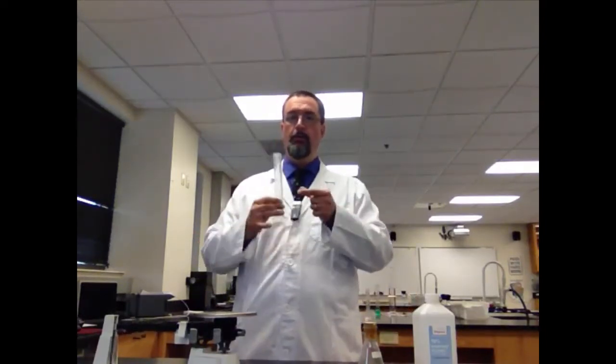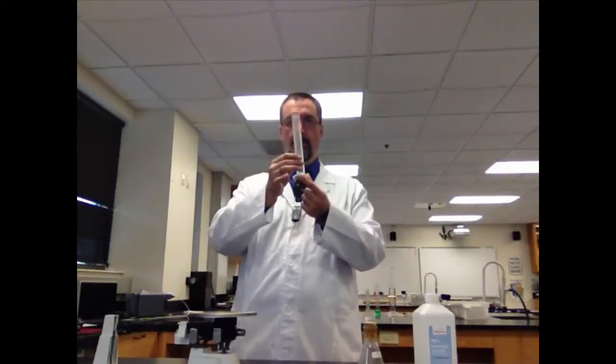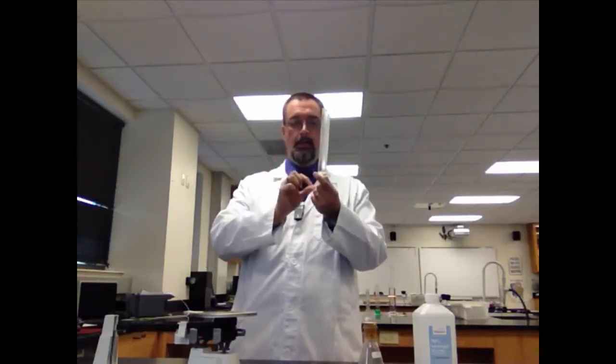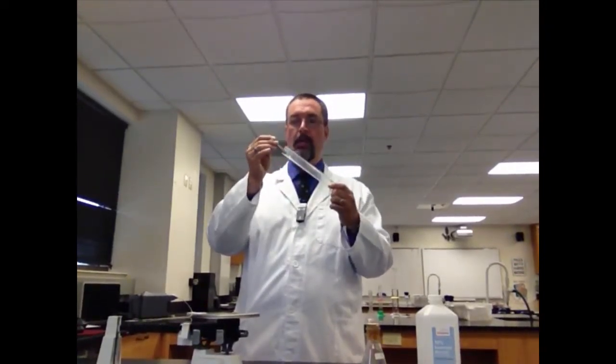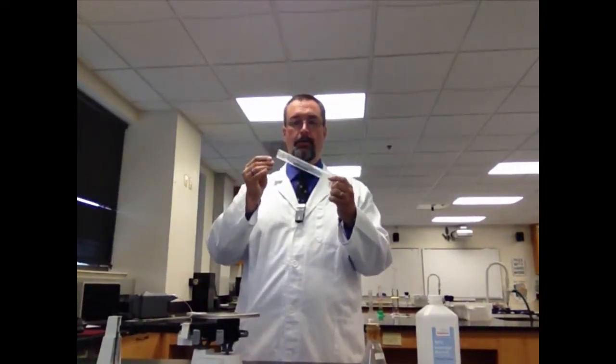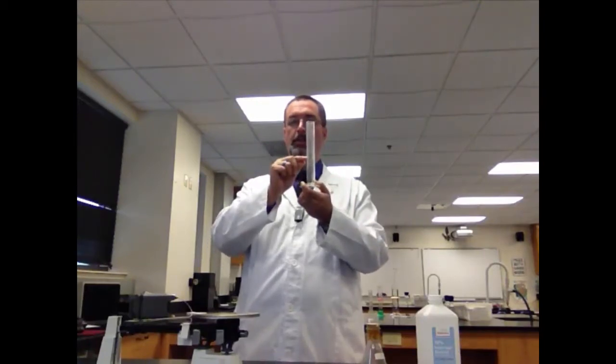The volume, you're already used to doing it. You're going to do it by water displacement. You're going to take a little bit of water in here. You'll measure the volume, carefully slide the cylinder down. The water will rise a little bit, measure the volume again. The difference between those volumes, that's your volume.